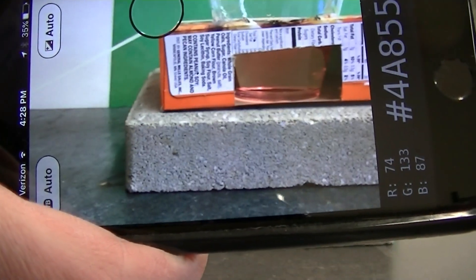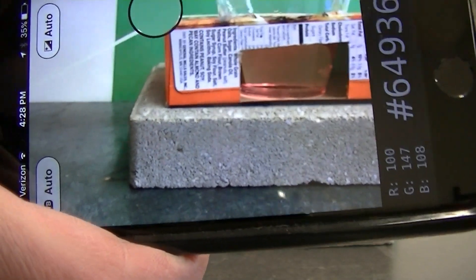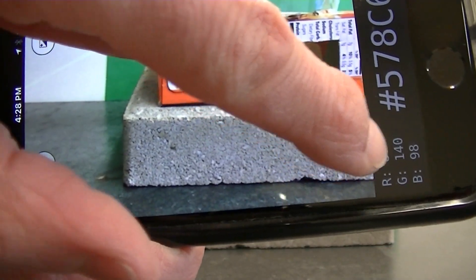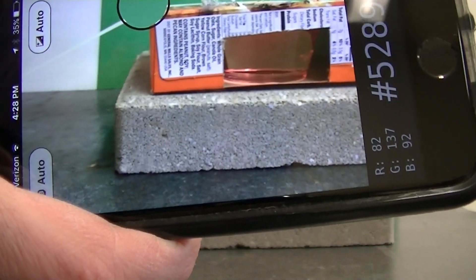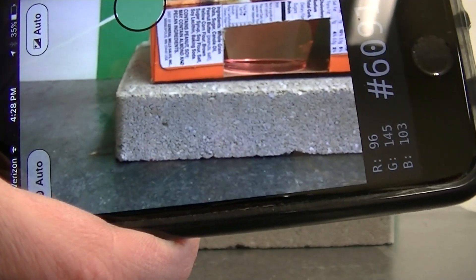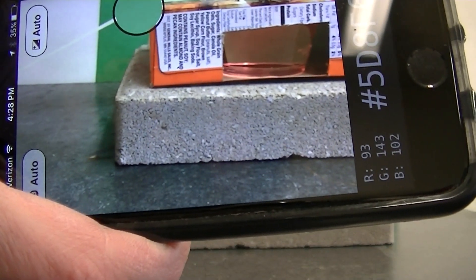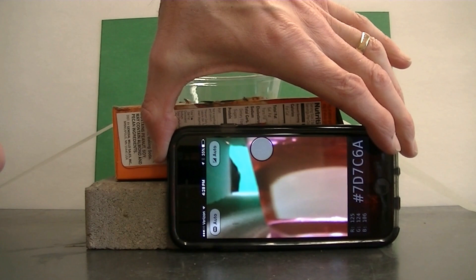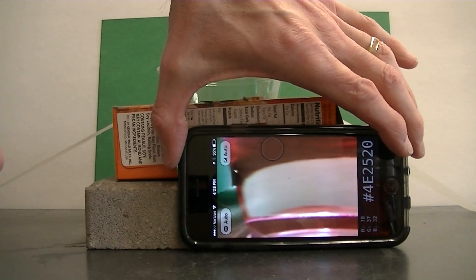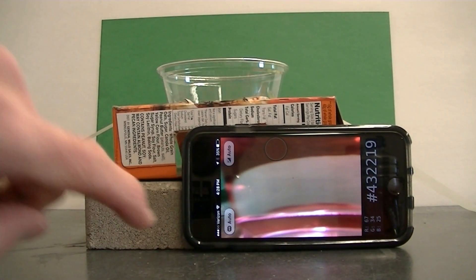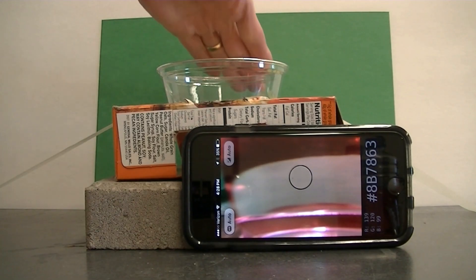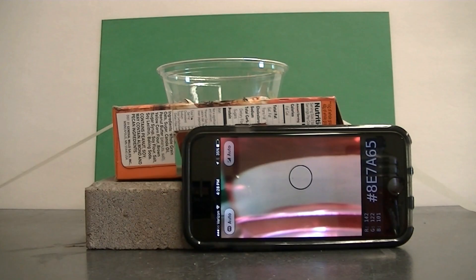And what this does is it takes the pixels that are in the circle view and it averages them and it gives you the average R, G, and B values for the pixels that are found in the circle. So we're going to use this as our detector of green light that's passing through the solution. I'm going to go ahead and set this up here so that I can see the solution in the camera view. And I'm going to go ahead and touch this so that I'm getting light that's being reflected off of the green background and going through the sample and being detected by the camera.